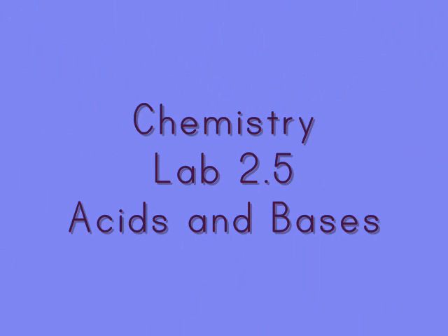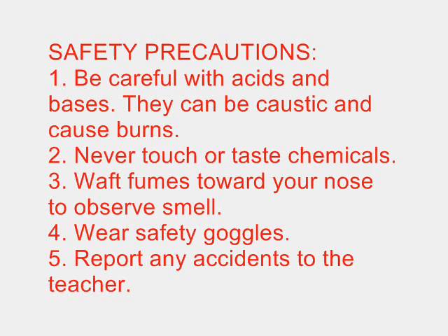This is the lab video for Chemistry Lab 2.5, Acids and Bases. The purpose of this lab is to use a variety of techniques to identify common substances as acids or bases.